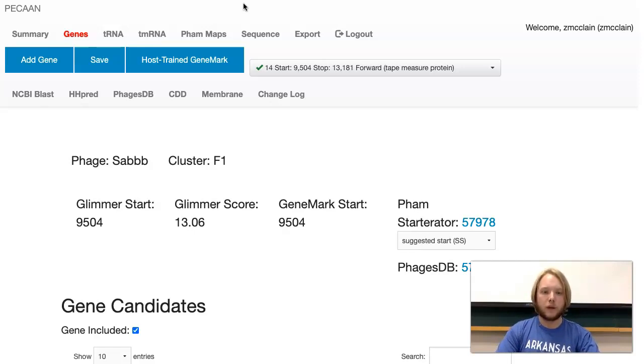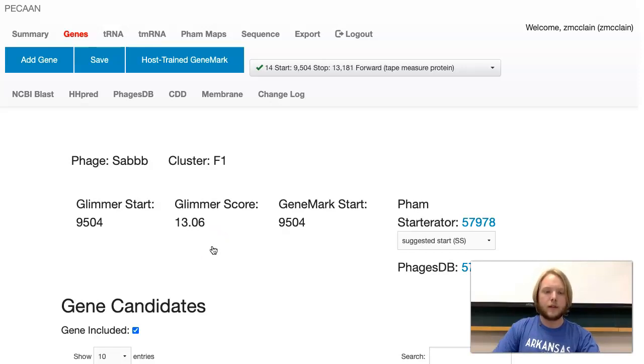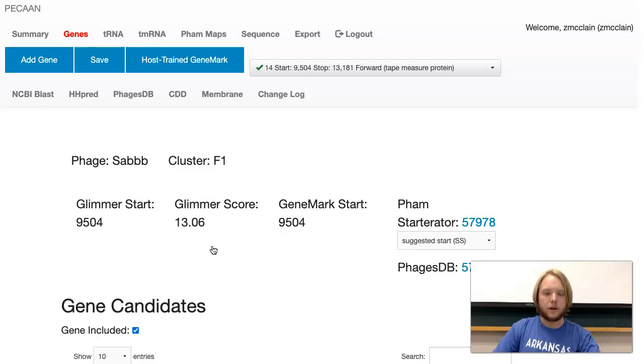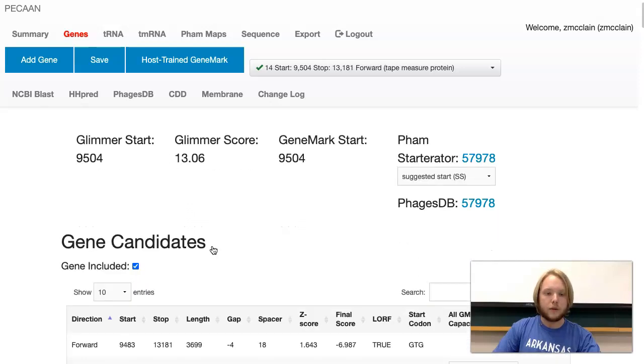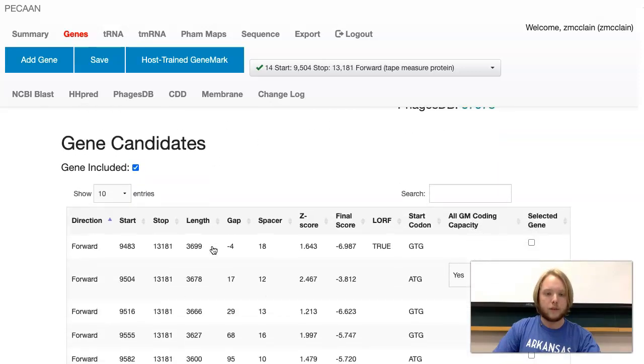Now, opened up before me, I don't have GeneMark. I have the website Pecan. The main reason is that it provides me with information about each individual start codon. There are different programs called Glimmer and GeneMark and Starterator that call different starts. These are start codons.